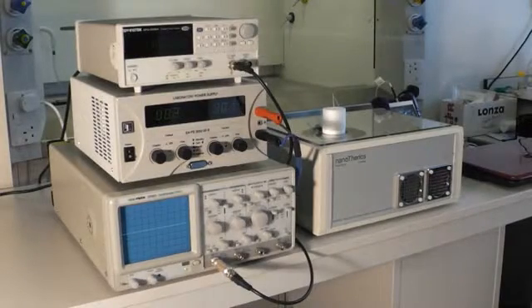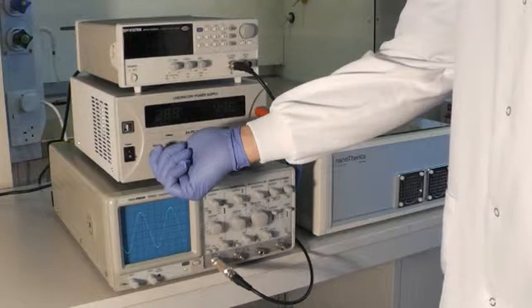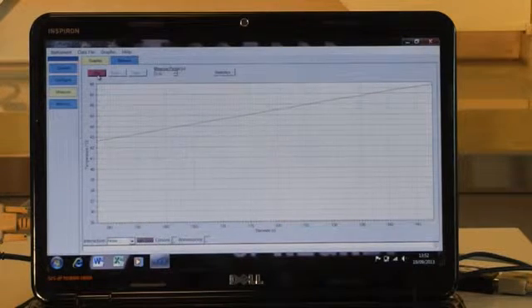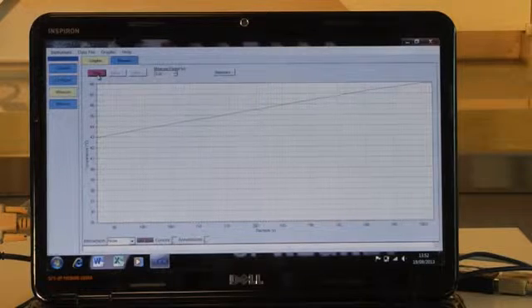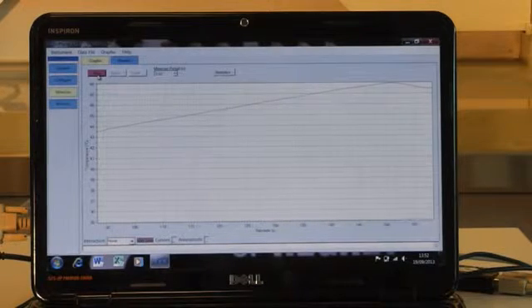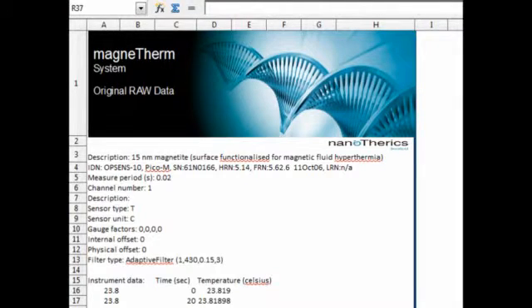Increase the voltage slowly to its maximum to achieve the peak-to-peak voltage provided in the matrix sheet. Now you will be able to observe and record the real-time temperature change within the test sample. The power loss calculation program will provide the specific absorption rate, specific loss power, intrinsic loss power values for the test sample and facilitate the user access to the raw data in Excel format for further interpretation.